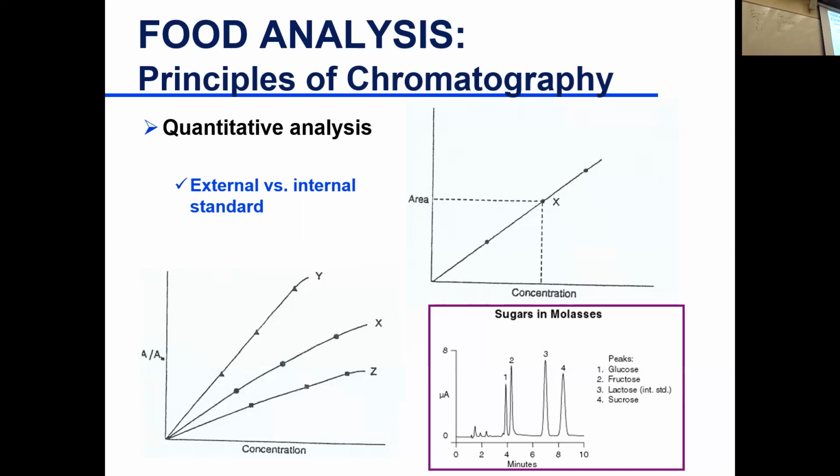So you have your internal standard as a check that the sample prep is going to preserve the integrity of your components. You know how much you added, to see if it's still there or not. But usually for quantification, you use your external standards for sure, and then the internal standard helps with correcting for areas of loss.